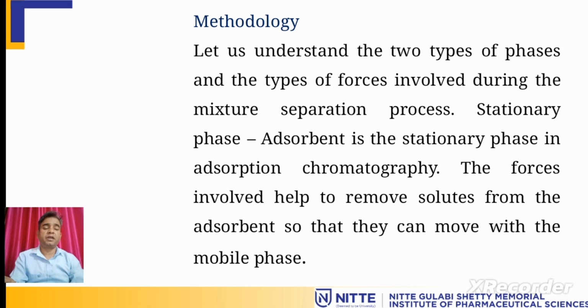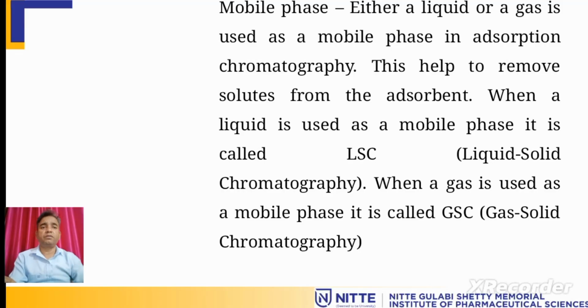Which you can find out later on, which stationary phase could be better for your study, and which particular solvent, called the mobile phase, could be better for the separation of the compound. So look here, when we look into the mobile phase, it could be either liquid or gas, which we will see in the coming classes about liquid chromatography. But we are not going to learn about gas chromatography in detail, because it is another unit. Where we learn about liquid-solid chromatography, it generally contains column chromatography and then TLC, thin layer chromatography.